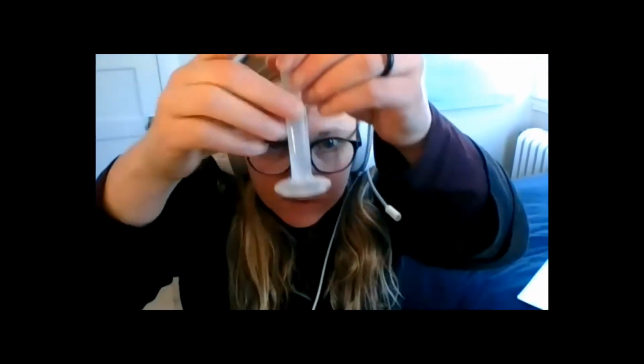And then I have your 10 milliliter graduated cylinder filled with, look at it, it's so very small, just 1 milliliter of water. I could even prove it there. 1 milliliter of water. You notice it is very, very small. 1 milliliter of water here and 100 milliliters of water here. You notice this one's a lot smaller than that one. That's going to be important. So little 1 milliliter, 100 milliliters. We're going to look at those next.